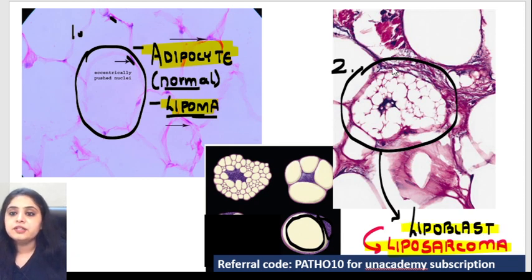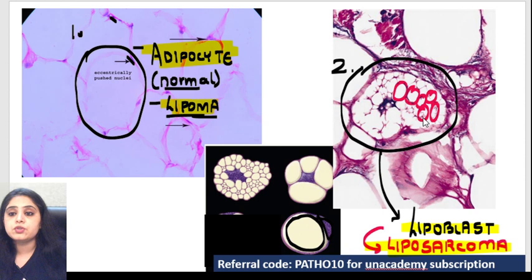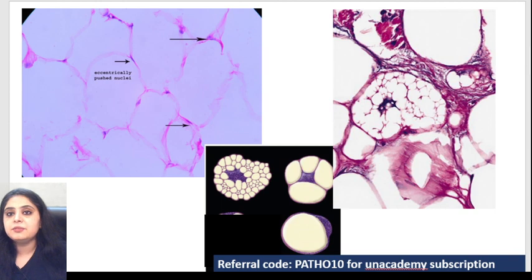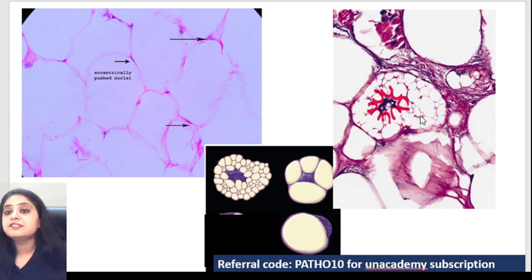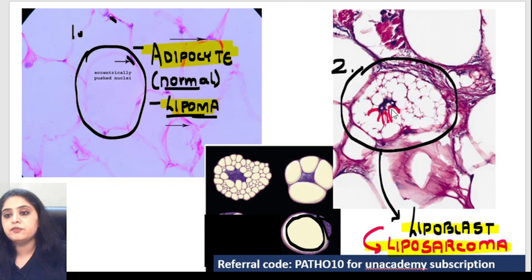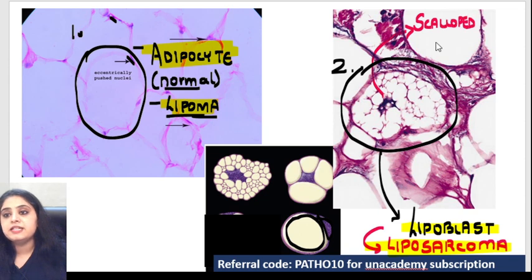And how does a lipoblast look like? Here you have this huge cell with multiple white spaces — these are all fat globules, that is why they appear totally clear. And if you see the blue colour nucleus in the centre, it looks as if someone is punching — all these fat globules are punching that nucleus from all around. Again it looks as if the nucleus is being punched by these fat globules. So we call this a scalloped nucleus. This kind of nucleus is known as a scalloped nucleus.